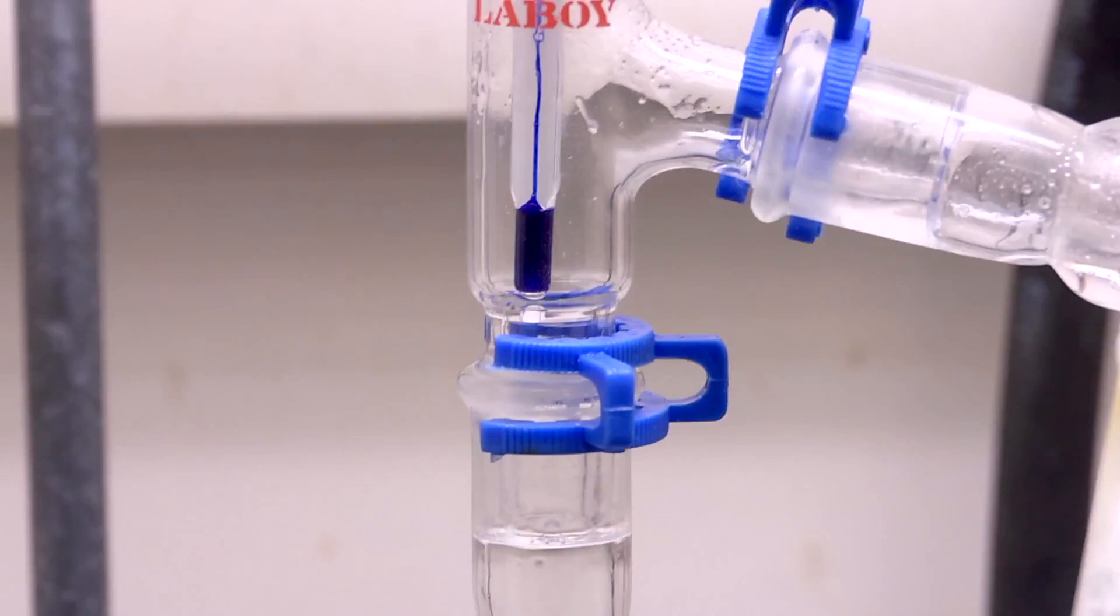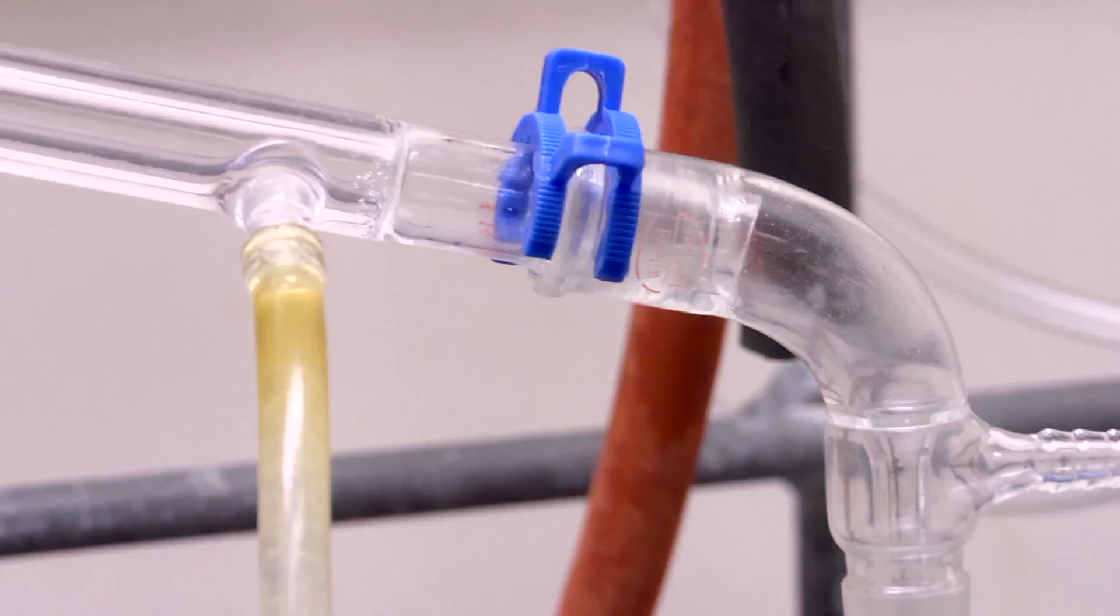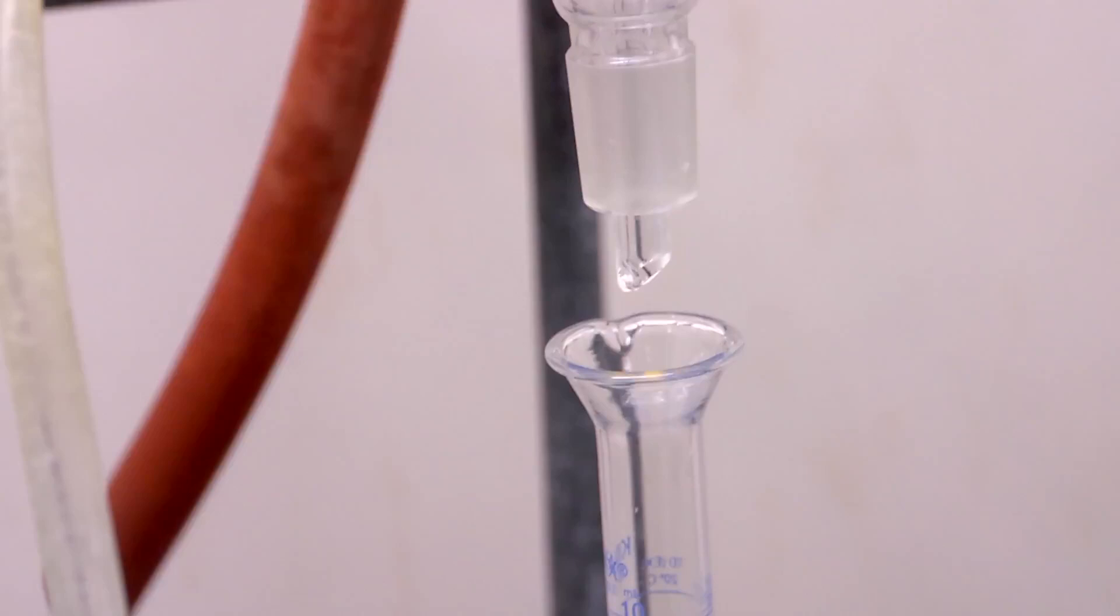The vapor and condensation on the beads will have greater composition of the substance with the lower boiling point. As time progresses and the mixture continues to boil, the vapor moving up the column will increase in purity because the substance with the higher boiling point is left behind to collect on the beads and fall back to the liquid.